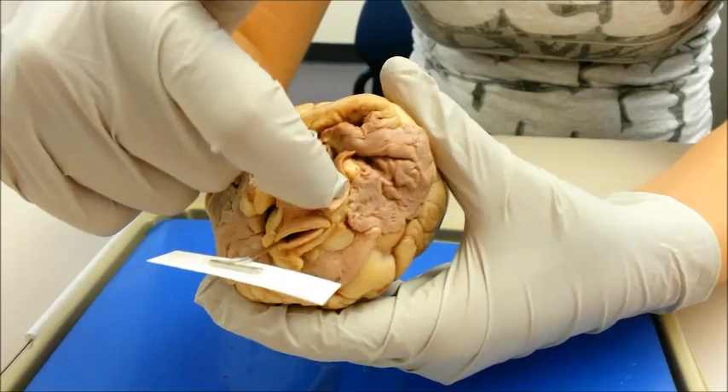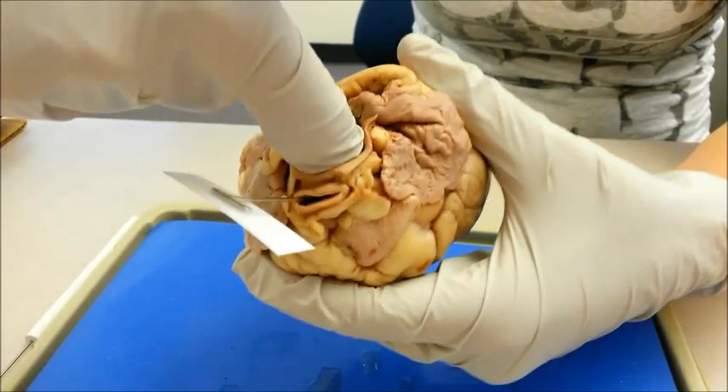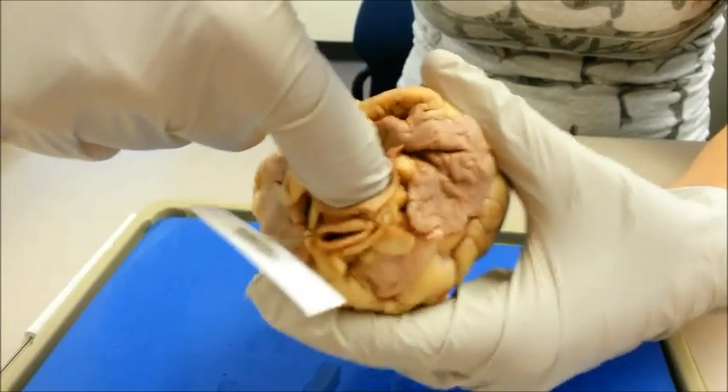The aorta is the large artery that emerges from the left ventricle. This artery carries blood to the systemic circuit.